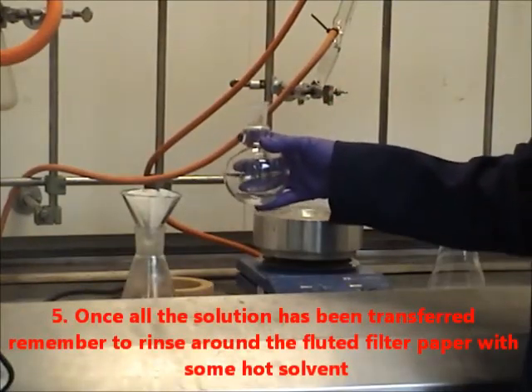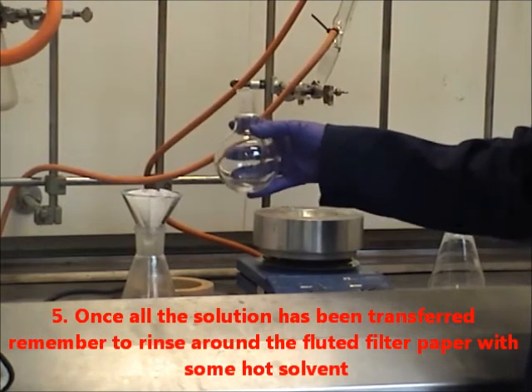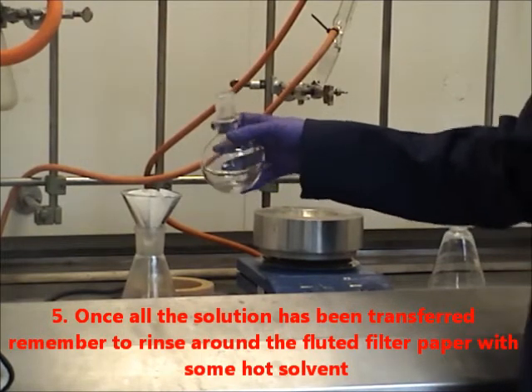Once all the solution has been transferred, remember to rinse around the fluted filter paper with some hot solvent.